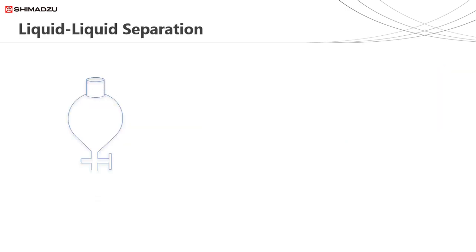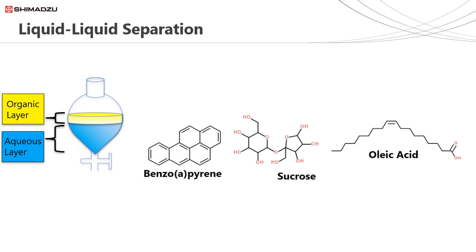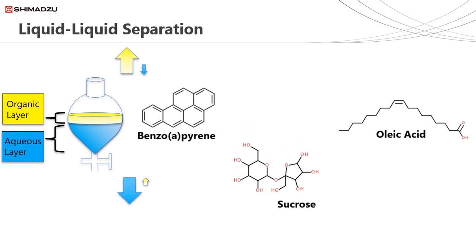We looked at column chemistry in terms of liquid-liquid separation, which works in a very similar manner to our column. We showed that highly water-soluble compounds had a higher affinity to the aqueous layer, whereas fatty carbon-rich compounds had an affinity for the organic layer. We used these three compounds to illustrate the movement during liquid-liquid separation.